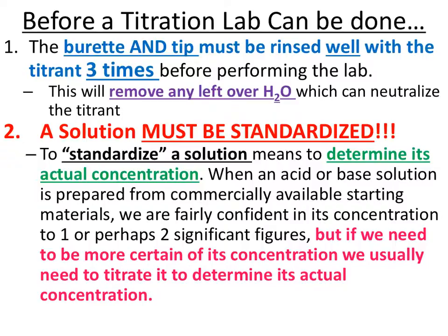Now, why do we want to rinse something 3 times before we ever begin? Make sure any water is out of it. Make sure any dust is out of it. And what we're actually having in that burette is pure solution, exactly what we want. Notice what else it says. Not only does it say the burette, it also says the tip. Because if we wash it out with water, and we have a little bit of water on the end of the tip and it falls in the solution, could that knock off a concentration? And guys, let me tell you, when I say this is very, very delicate, one drop can throw the entire thing off. So water is very, very particular.